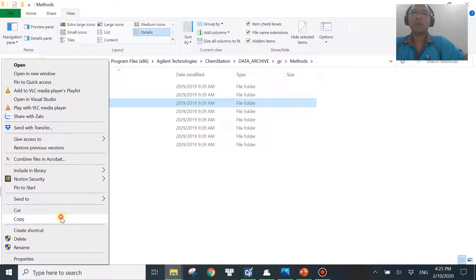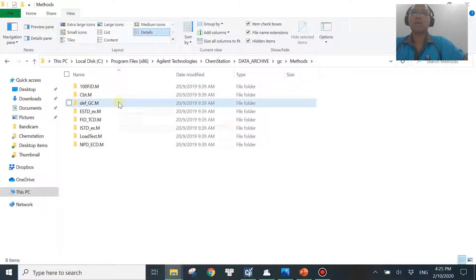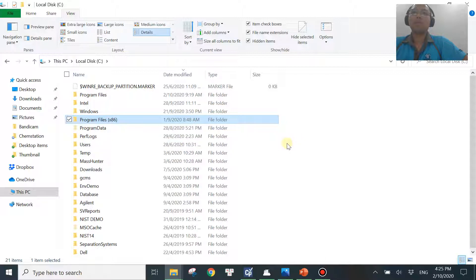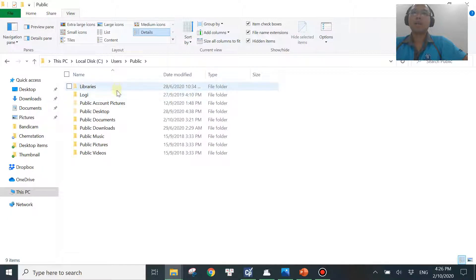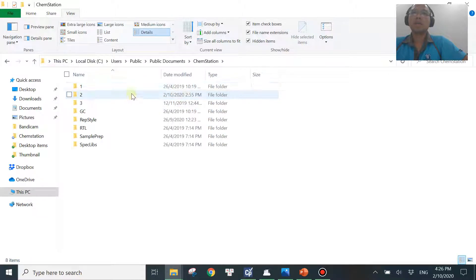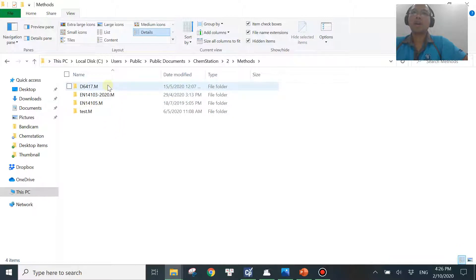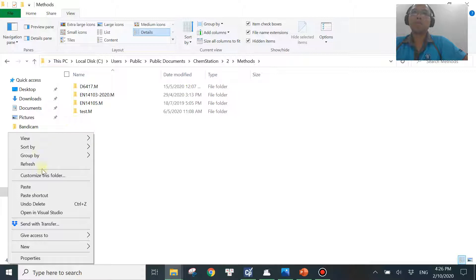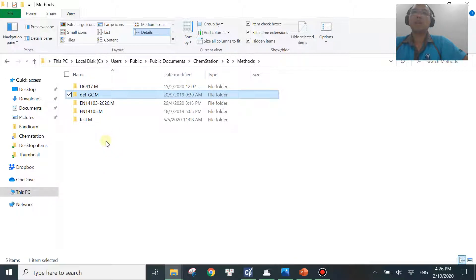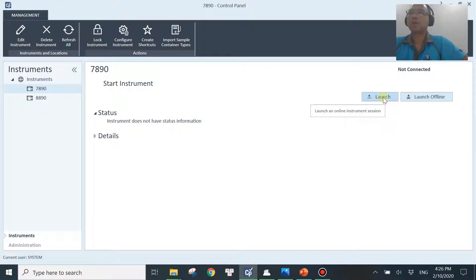You just need to copy the def_gc.m file — right-click and copy it. Then move this method over to your master method folder. For the new version like the one I'm using, that path is: C, then Users, then Public, then Public Documents, then ChemStation, then the instrument number (mine is number two), then go to Methods. As you can see there's no default gc method here, which is why the software was not able to launch. Paste the default gc method here and you should be good to launch.